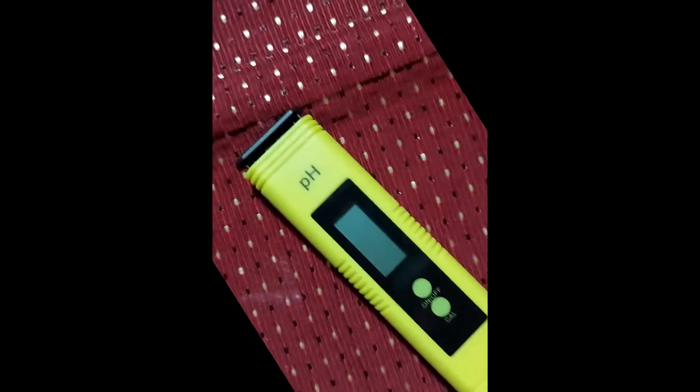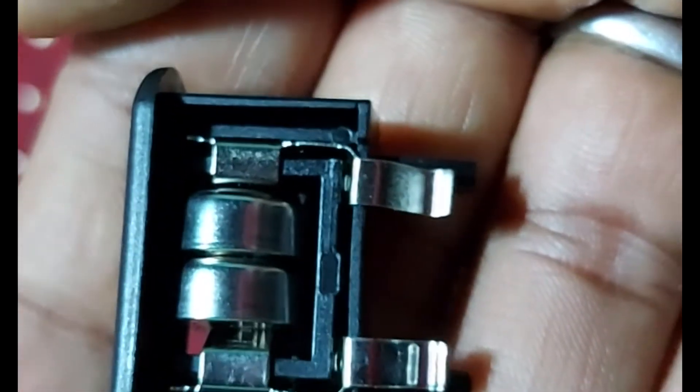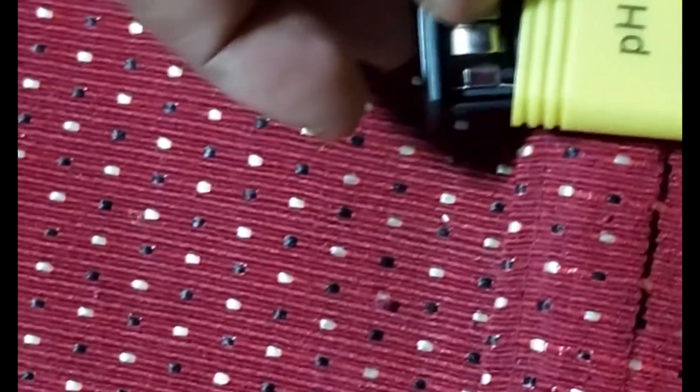See how easy it is to use — you can read the pH up to two decimal points, it's so accurate. For the batteries, just take out the top part and you'll see two small watch batteries inside. Very easy to use and replace — just put the top back in.